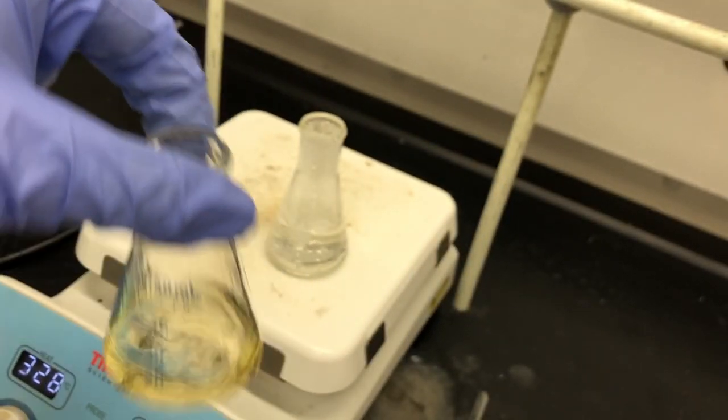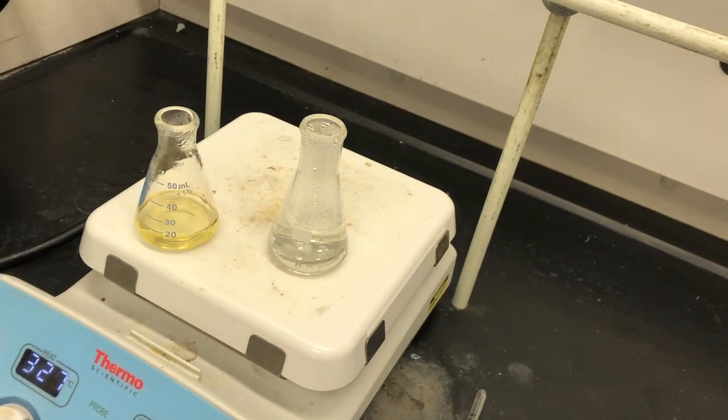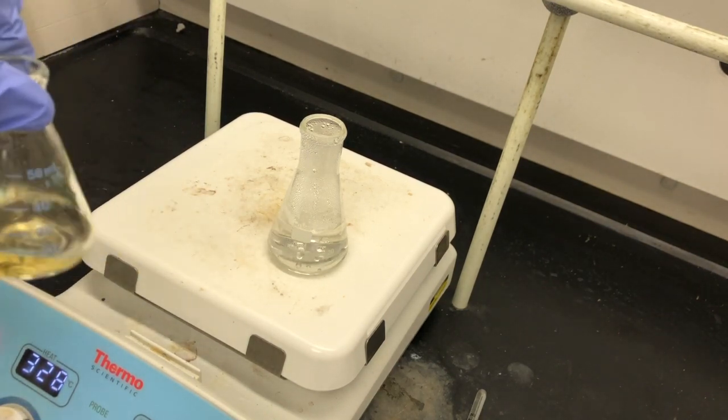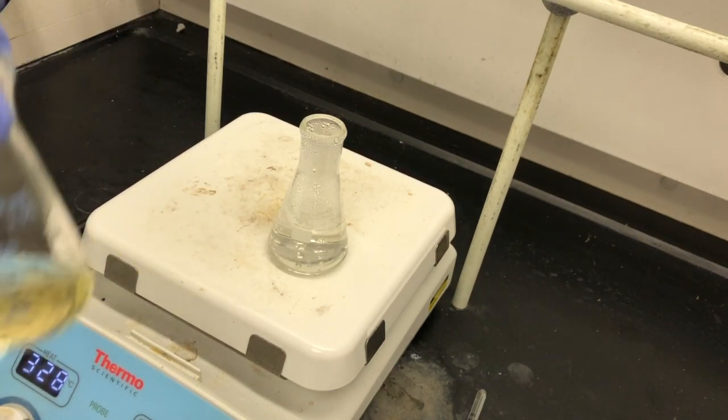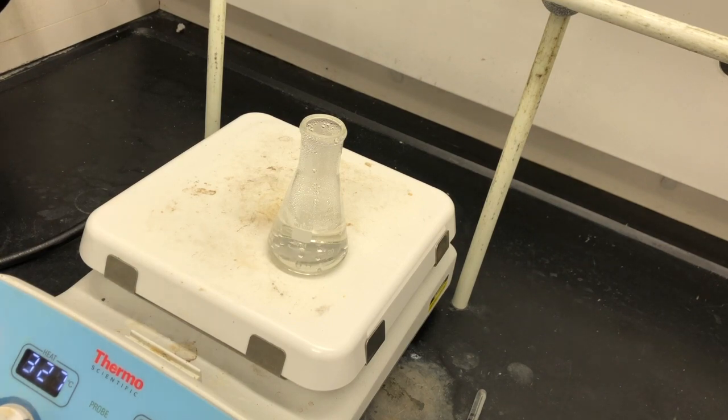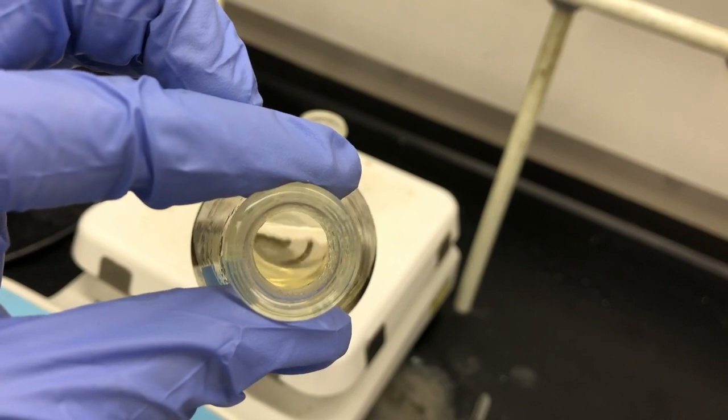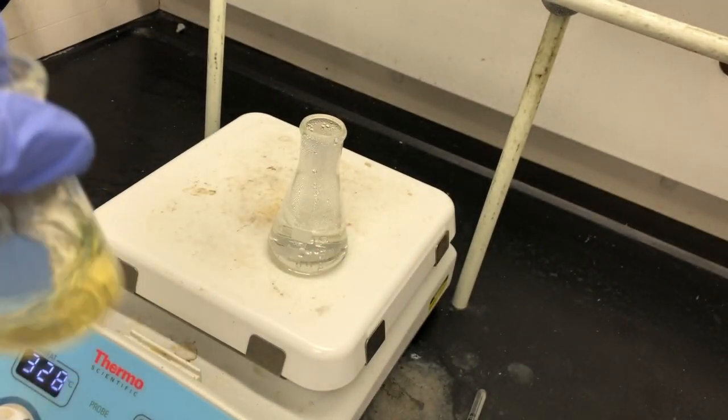So now the idea is that our compound of interest that we're trying to recrystallize which is NBS is soluble in the hot solvent and then it's insoluble as we allow it to cool slowly into room temperature and then being placed in ice. And that slow cooling that will take place is really important to allow the crystals to form without any impurities present.